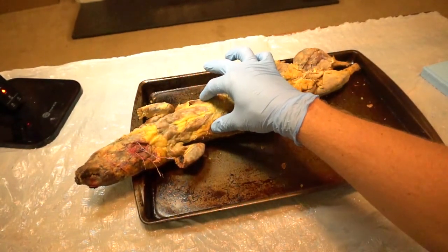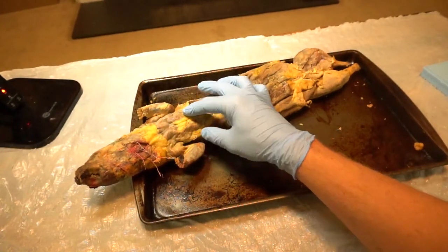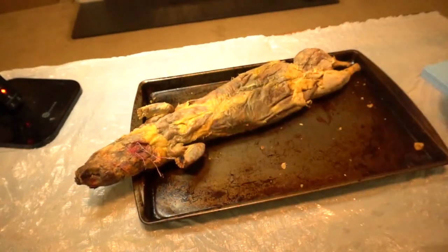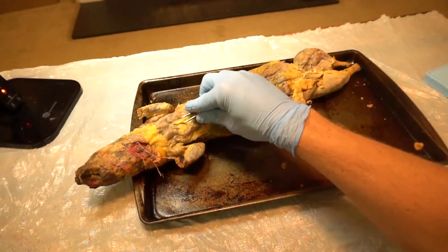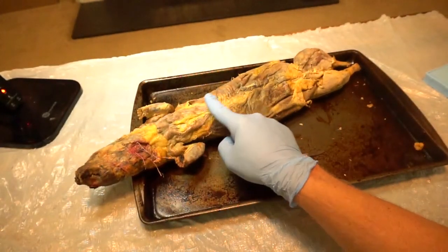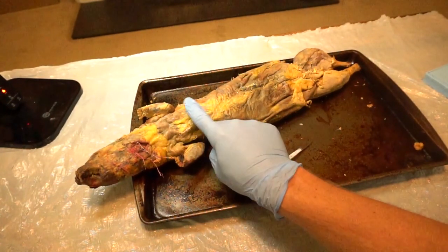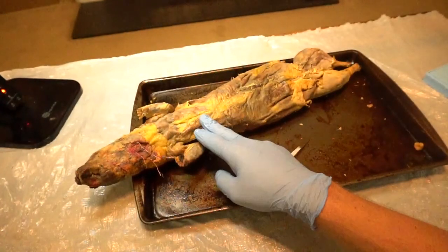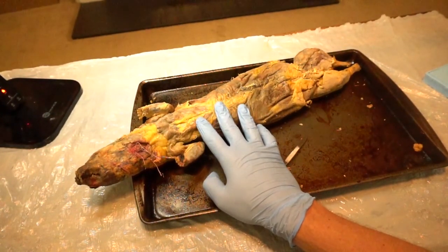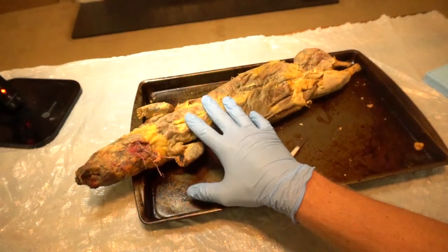We're going to start with the thoracic region. As you can see there's tons of fat all over my mink, but you can still see some of the muscles. What I suggest you do is start peeling off the fat — you can use your fingers or the curved forceps, making sure you're using the back side of the forceps so it's safe, not puncturing any muscles. You can also take a piece of paper towel to fray any connective tissue. You're trying to find the borders of these muscles, so look in your lab manual at the cat muscles, since mink muscles are pretty similar.